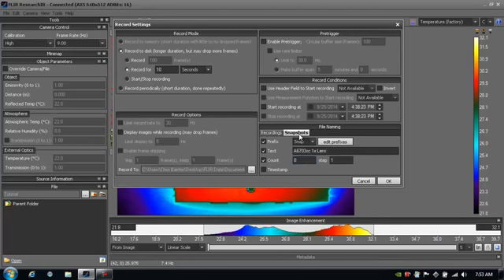I also have naming options if I want to do a single snapshot, and I can include those here too as well. Today I'm just going to record a movie, so it looks like we're all set. We're going to record for 10 seconds, and the recording name is going to be REC A65SC Benchtop Test Kit, and then the counter is going to start at 0.